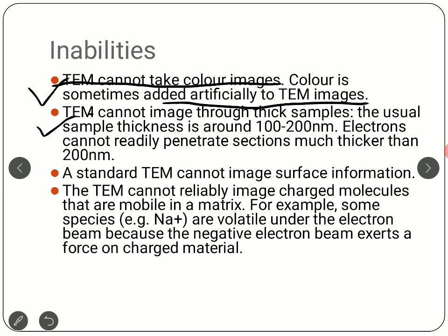TEM again cannot image through a thick sample. As I told you in the very first slide, usually the sample thickness is around 100 to 200 nanometers. Thicker than that, the electrons usually cannot penetrate, and then we cannot get any kind of signal to do the TEM study. A standard TEM cannot image surface information, so it doesn't give any kind of surface information. Surface morphology is more or less studied using SEM.